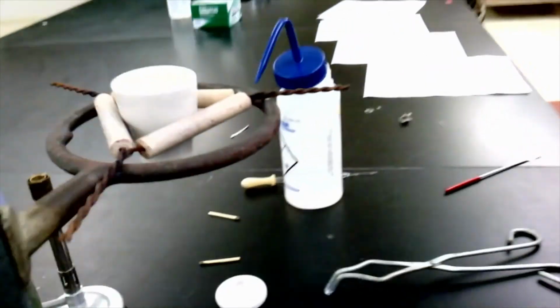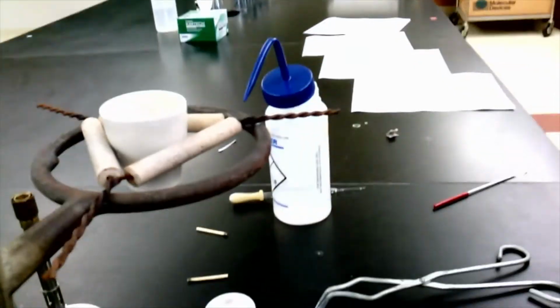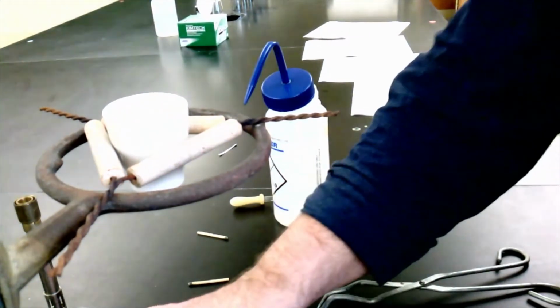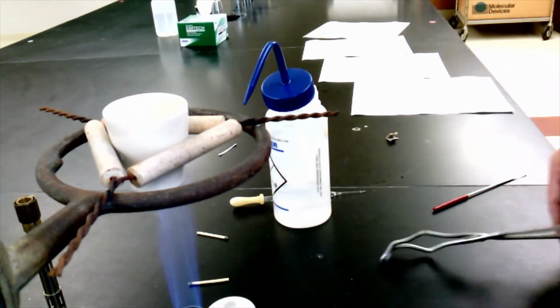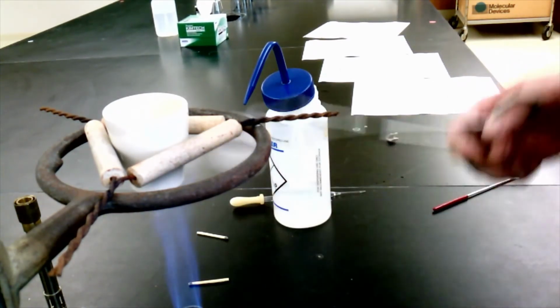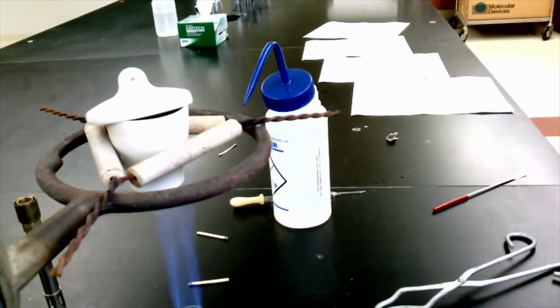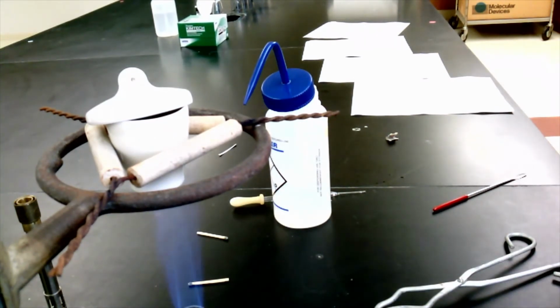So what I've got in here is a nice little soupy slurry of stuff. And now I need to get all that water out again. So I'm going to heat it sort of gently, and I need to do this with the lid on because as the water boils it might start splattering. I just saw it splatter a little bit. So I'm going to heat it with the lid on. We're going to heat it gently for a few minutes, and then we're going to heat it strongly for a few minutes, and then we'll be ready to take our final mass and see what we got.